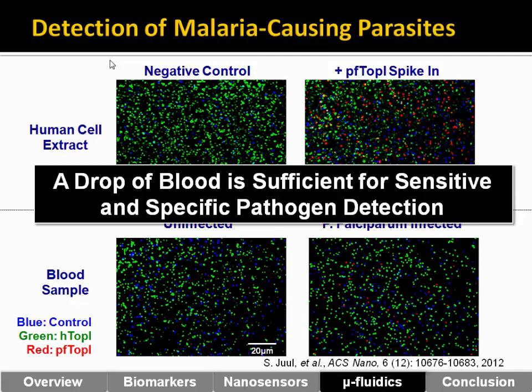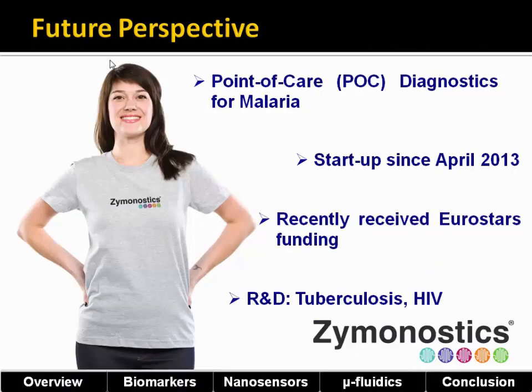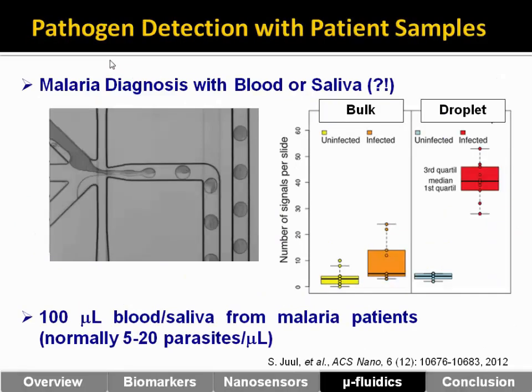Why is it so? Because we are doing all these experiments in a small volume. So we introduced a microfluidics-based droplet generator to incubate all these DNA substrates and pathogens in a small volume, again a few hundred picoliters. Shown here is, I hope the movie will work. Okay, the movie does not work. But anyway, I'd just like to show you the droplet generation.